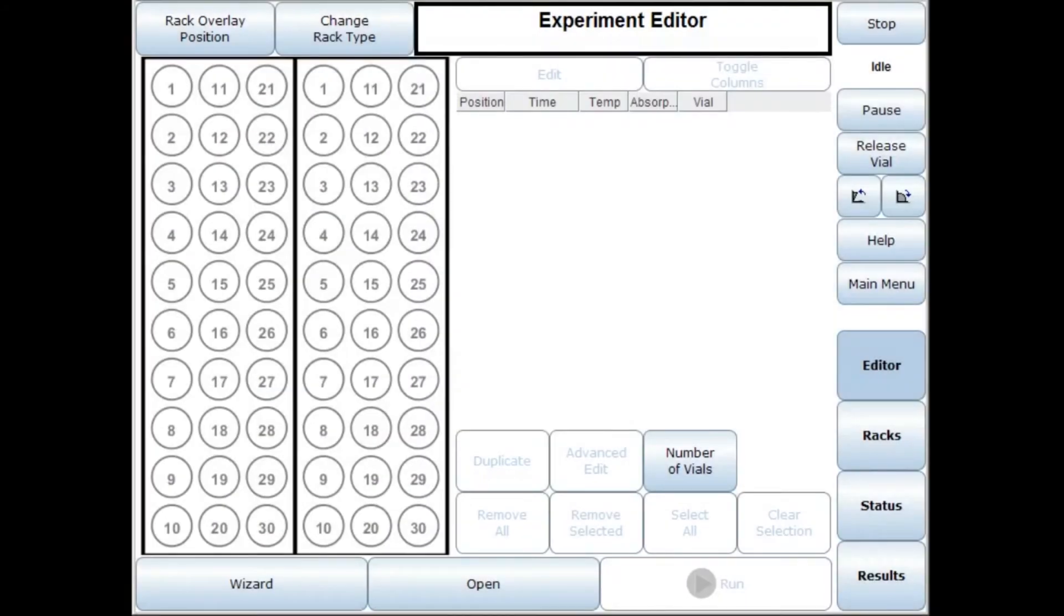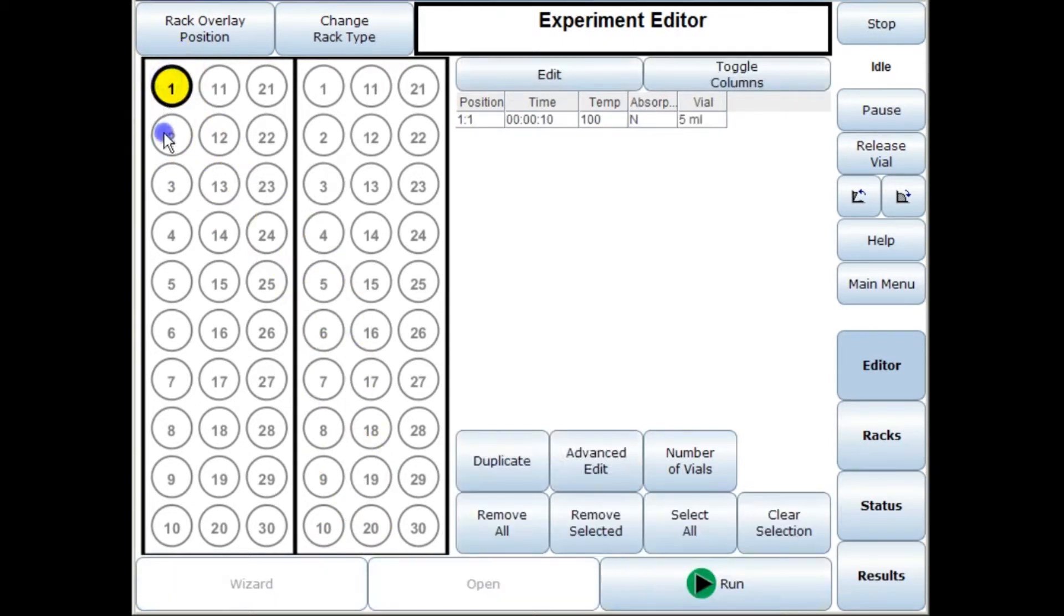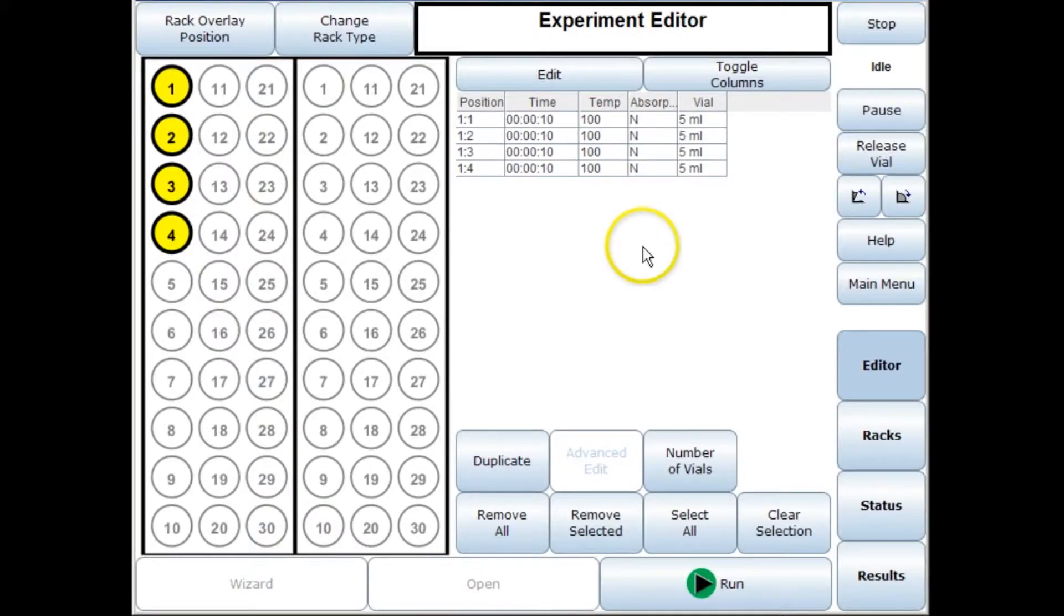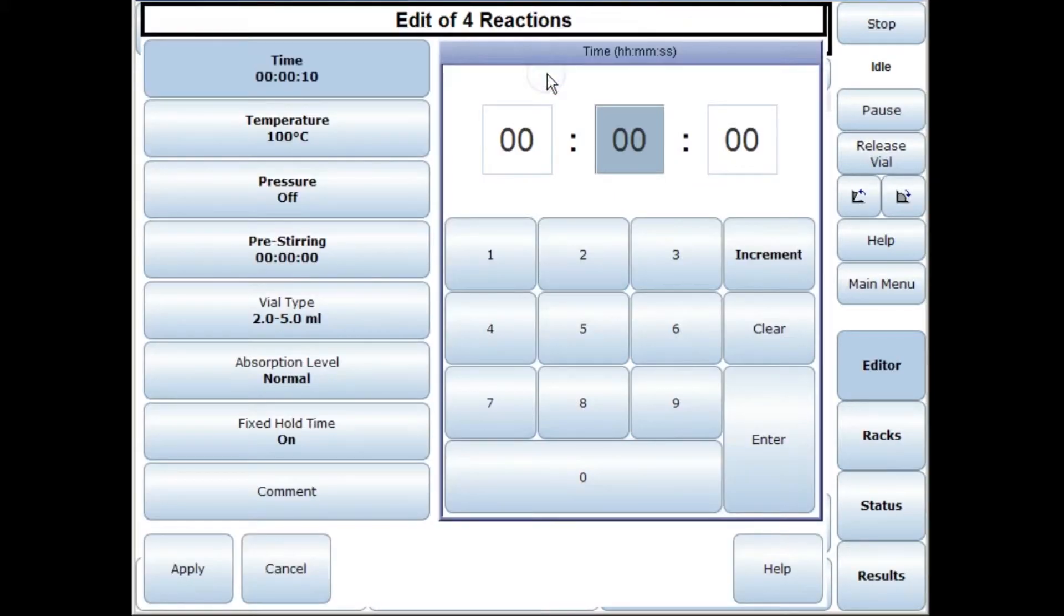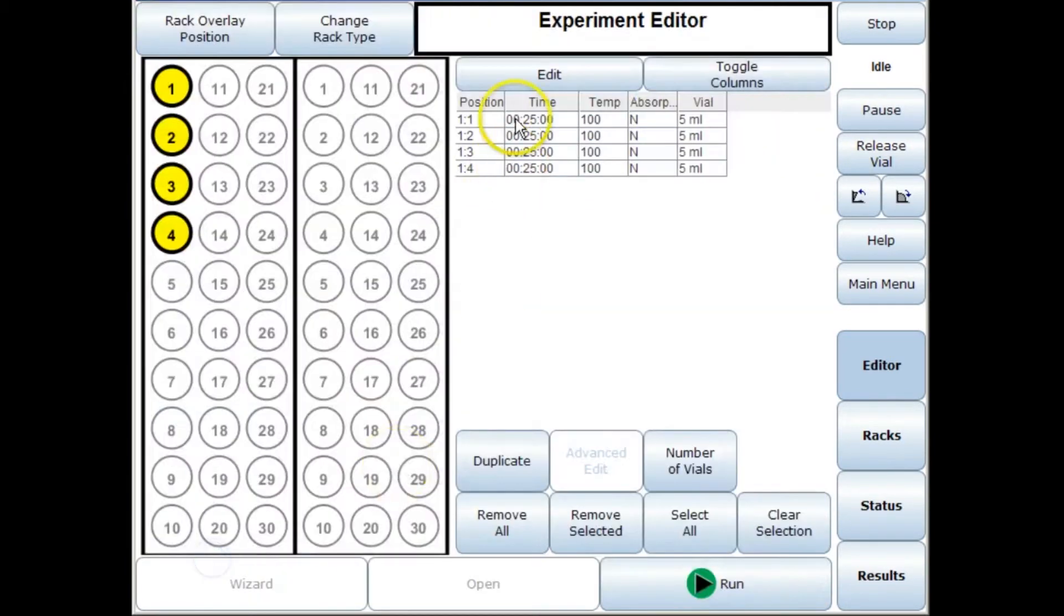Another really great feature of automation on the Initiator Plus is if you wanted to optimize a certain set of reaction conditions you could do this on a number of different vials. So say we want to have four sets of different reaction conditions we can select four different vials, we can put in the standard reaction conditions 25 minutes at 100 degrees and apply that to all the vials.